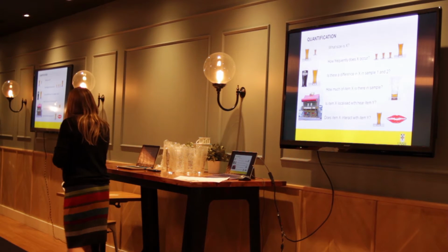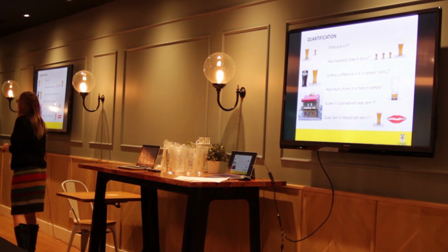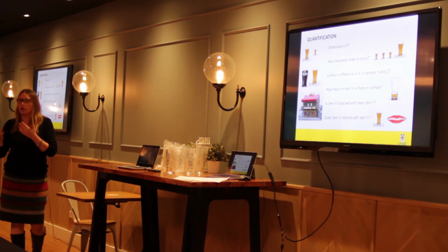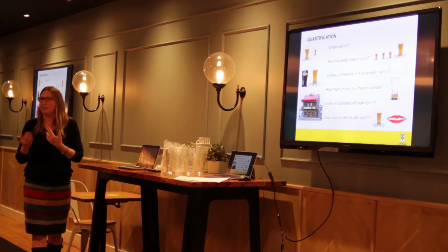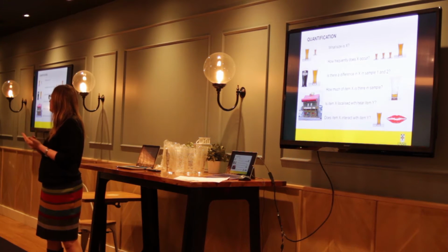So of course, quantification can be done on a microscope, and a lot of it does have to do with how you save your data. We don't save these sort of things. Okay? We want to be able to know that every pixel that we're looking at, that intensity value, is actually going to give us the right numbers. We don't manipulate them. Okay?